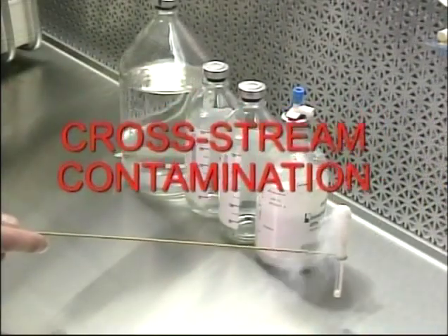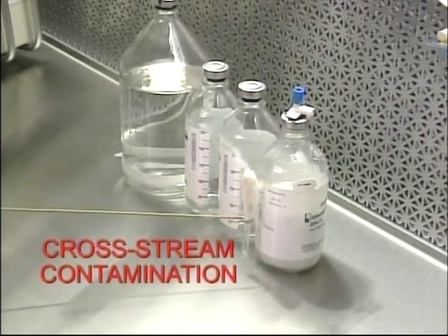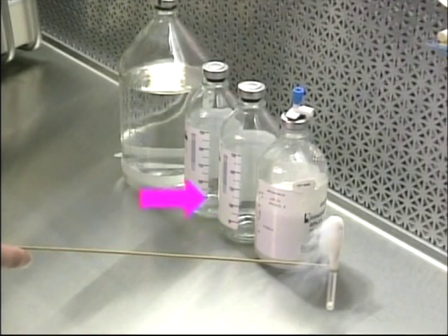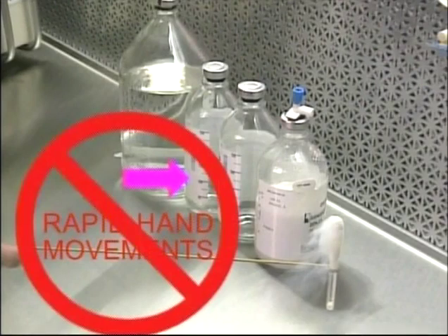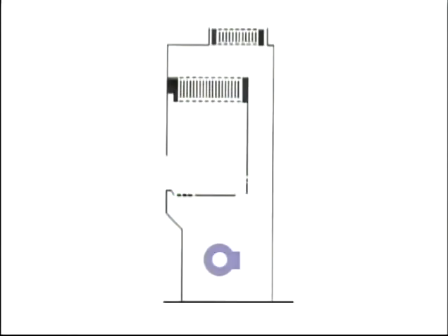Cross-stream contamination occurs when disturbances created in the airstream cause air currents to flow crosswise in the LFCB, carrying contamination from one object to another. Cross-stream contamination may occur if items are placed too near each other, or if the operator uses rapid or disruptive hand movements within the LFCB. Methods of minimizing the potential for these types of contamination will be discussed in the aseptic manipulation section of this program.